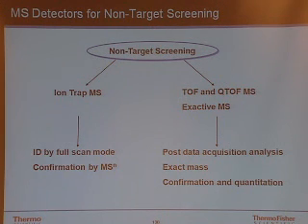The alternative to doing that is the exactive mass spec. An exactive, as I said this morning, is called that because it gives you exactly the molecular weight of the unknown compound. Now, time of flight will give you to the nearest 1 millimass unit. The exactive will give you to 0.01 millimass units. So there's a factor of 1,000 difference in molecular weight accuracy.